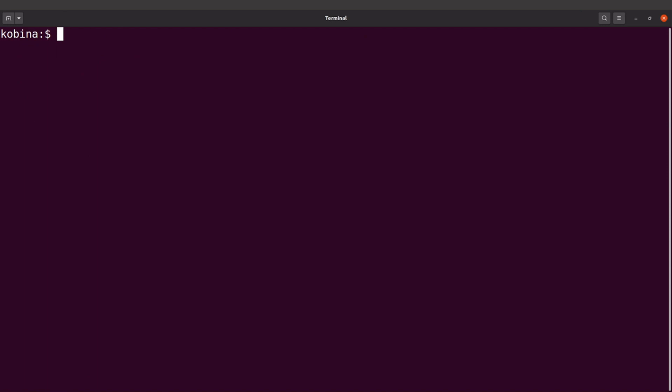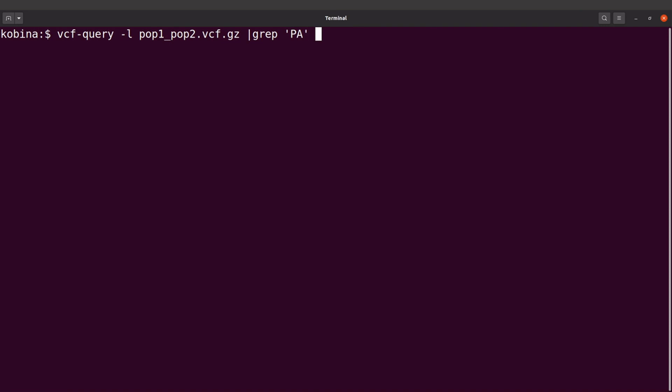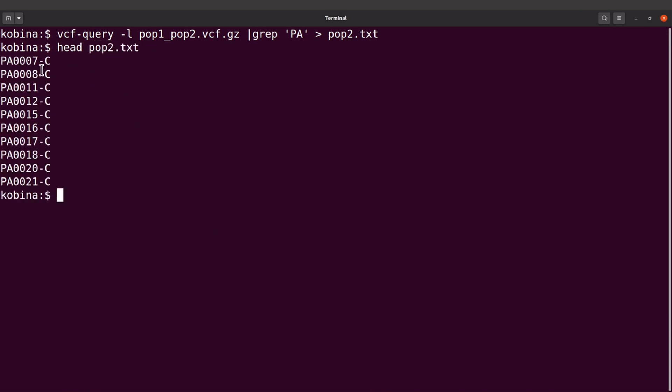Now let's do for pop2. So for pop2, that's population two, it will be vcf-query -l, I still get my VCF file, and then I'll say grep and this time I say PA, and now I'll just save it as pop2.txt. Okay, so that's for pop2. I'll use the head command to display the first few lines here. Okay, so that's for PA.